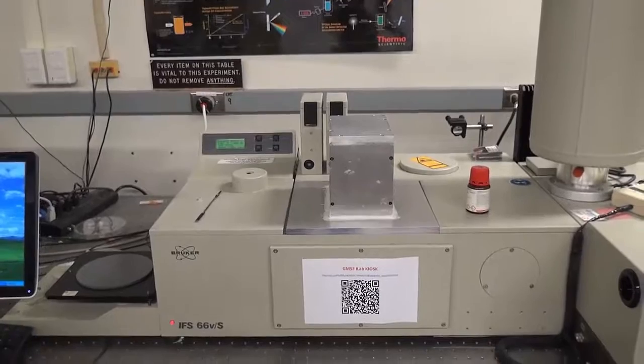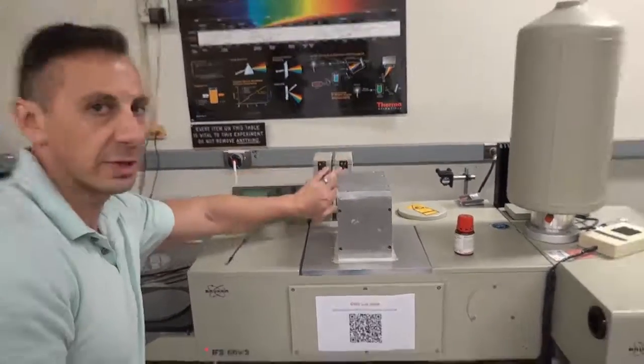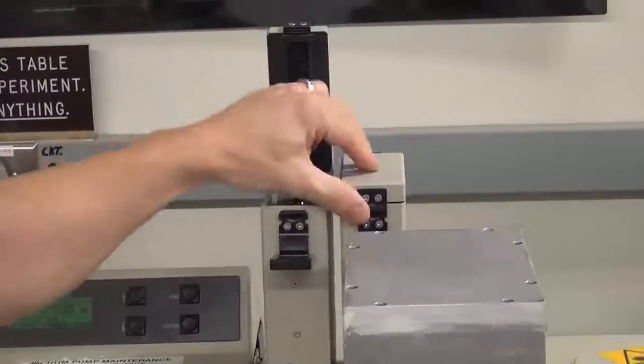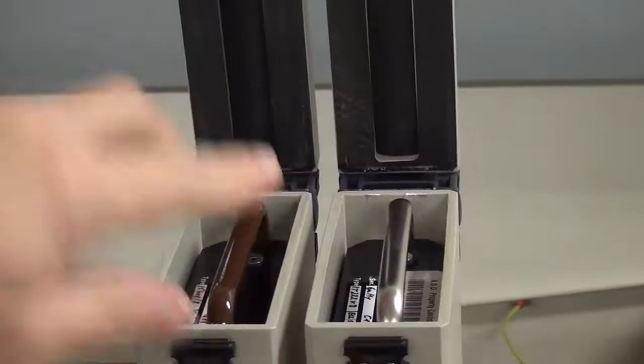There are two ways to check which beam splitter is installed. The first is to check the storage boxes to see which one is missing. As you can see in this example, the brown and the silver beam splitters are in the storage boxes, so the red one is installed.